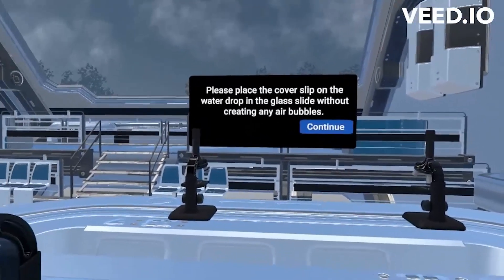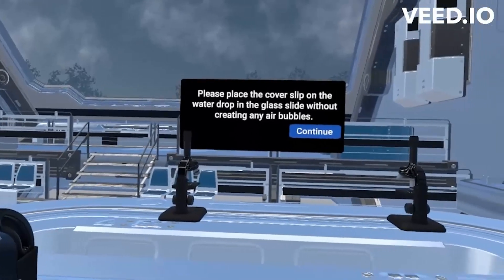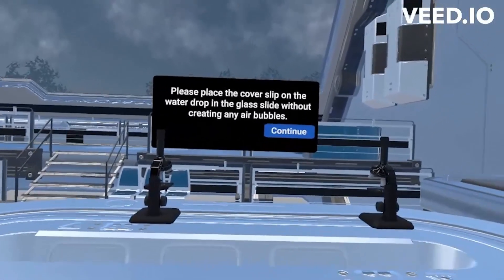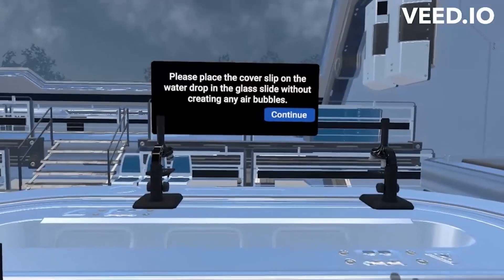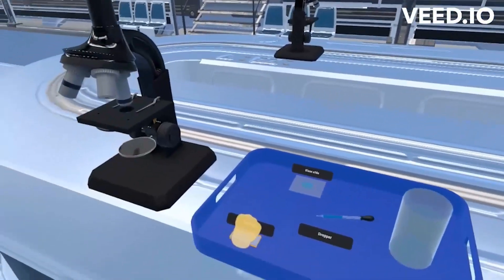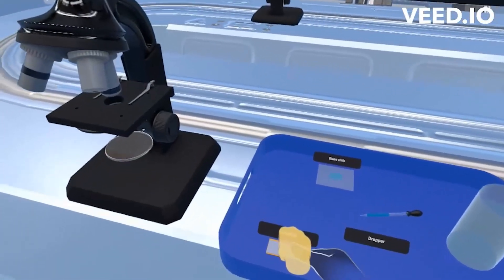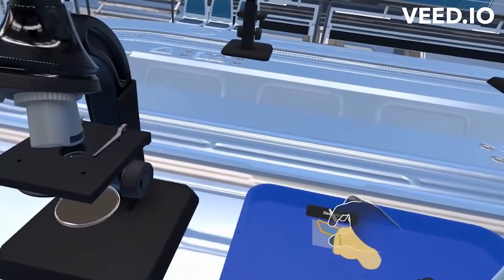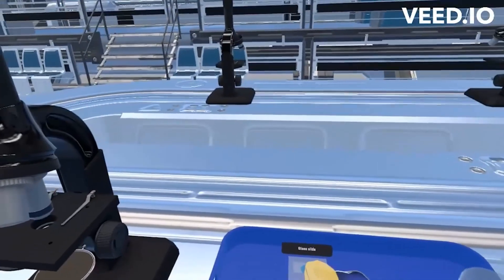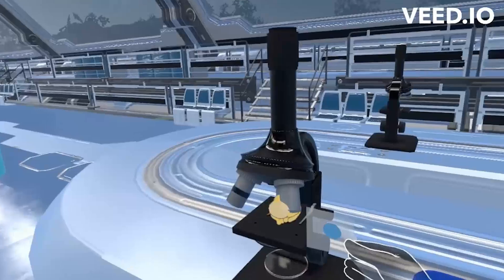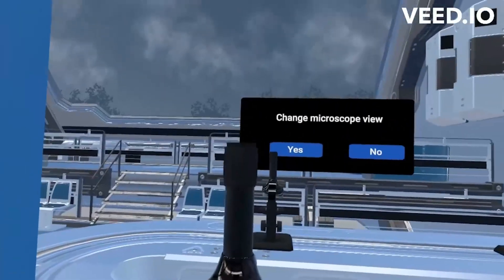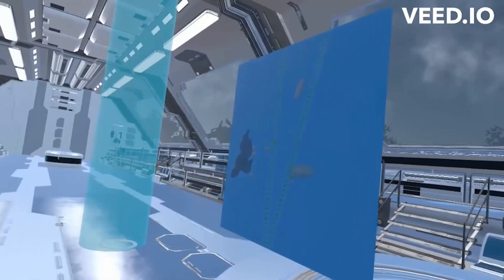Please place the cover slip on the water drop on the glass slide without creating any air bubbles. Place the glass slide under the microscope. Improve focus using the coarse adjustment knob.